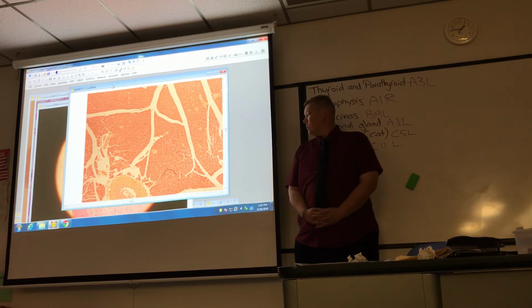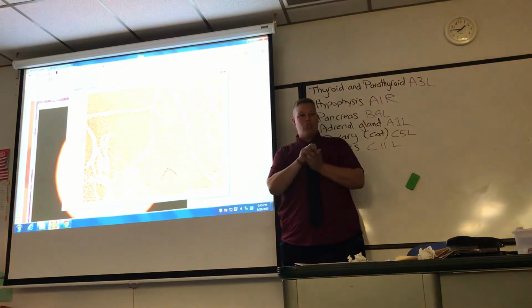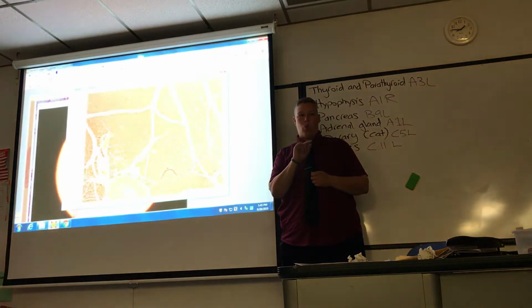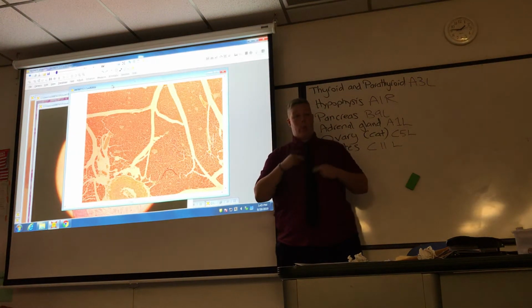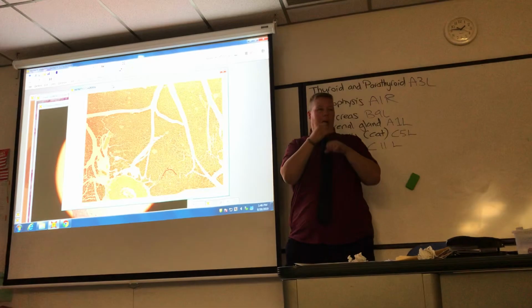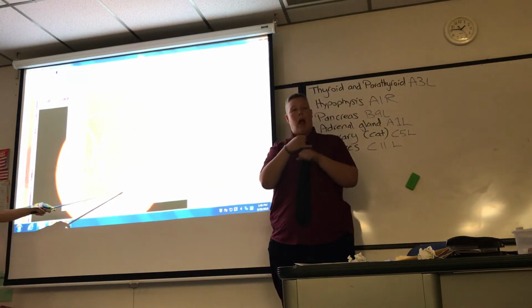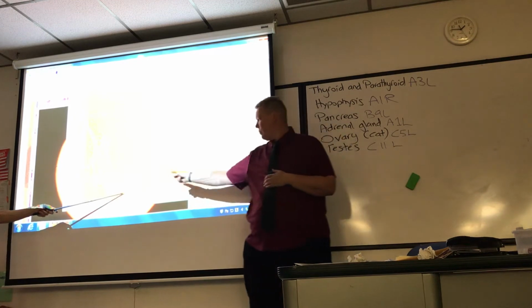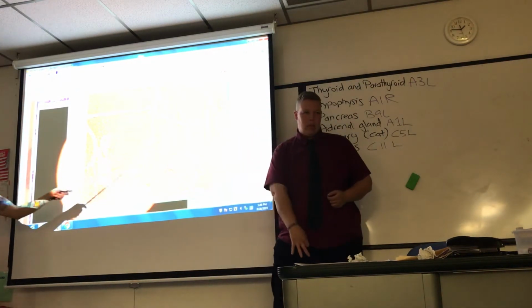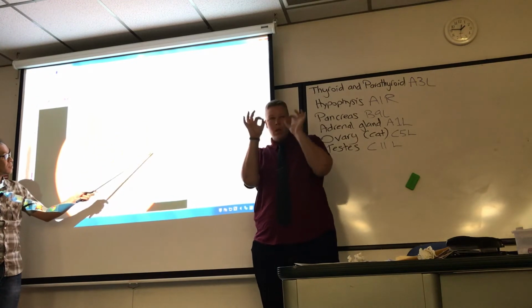Okay, a lot of things here. The pancreas is for digestion and for endocrine function. We're interested in the hormones that regulate blood sugar. There are these little clumps of cells hidden, little islands of cells. It's called the pancreatic islets. And then you have other things like a big old pancreatic duct that's going to go to the intestines. Blood vessel, I think. This is what we're looking for. Or maybe that.